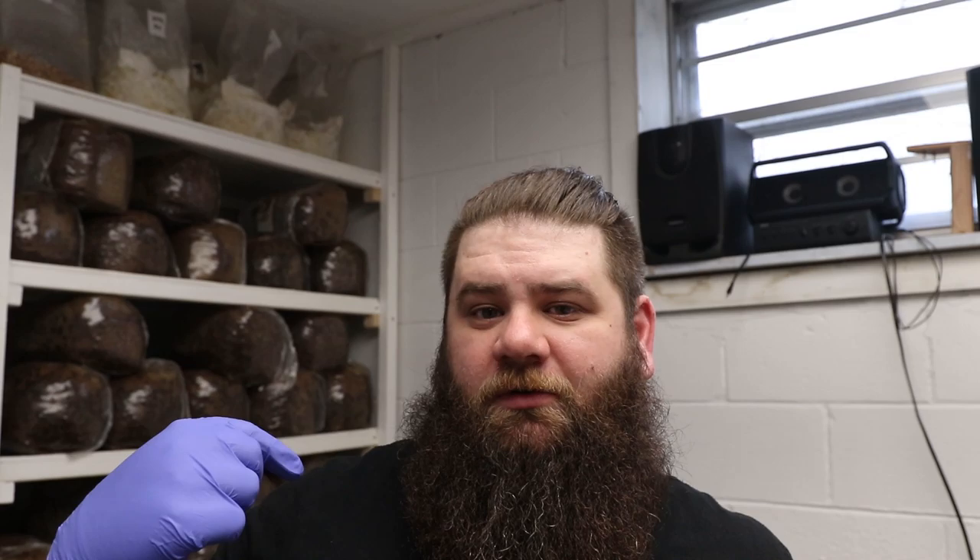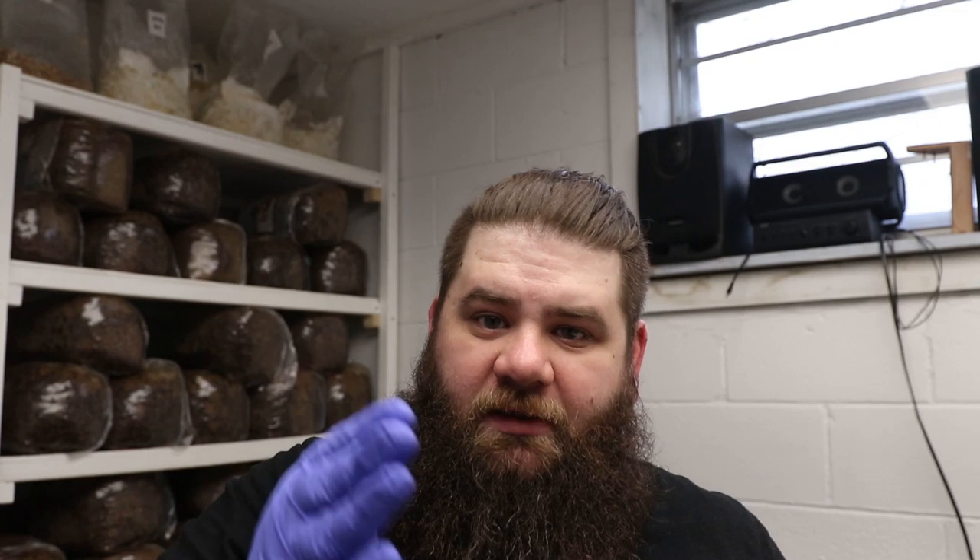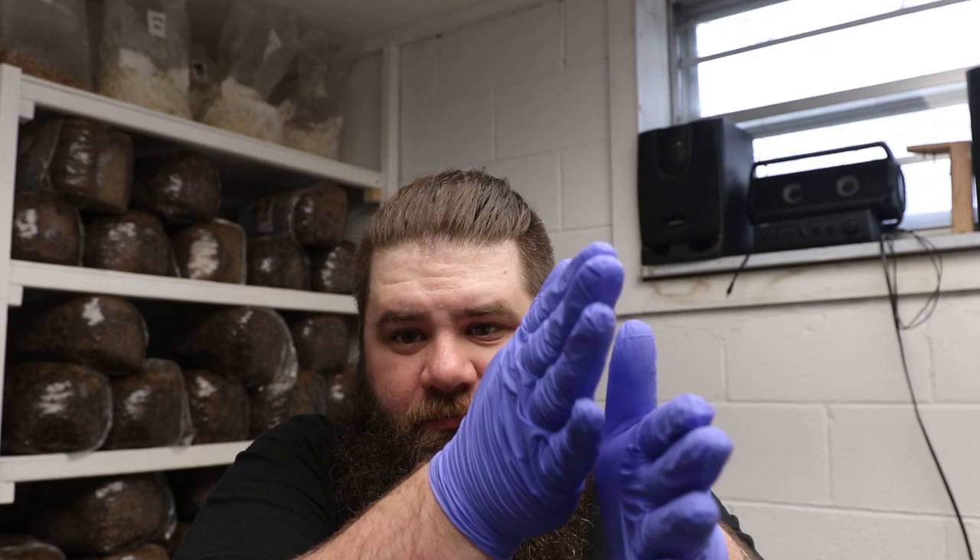Water agar robs the substrate of pretty much any nutrients. That's actually one of the reasons I use RO water in my water agar instead of tap - though tap works just fine, I just wanted to remove even more nutrients. Mycelium is able to grow very slowly, very anemically across that water agar. Bacteria and yeast can't transport food from their original food source to the ends - they have to replicate and bud out the whole way through, meaning they have to be able to eat where they lay. Mycelium doesn't have that problem. Mycelium can grow right through.